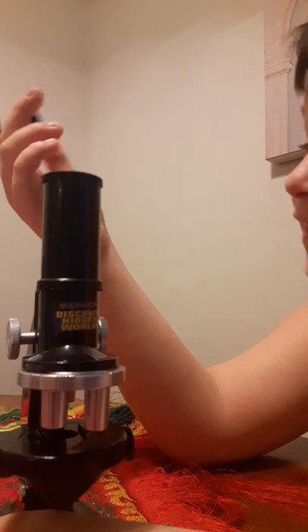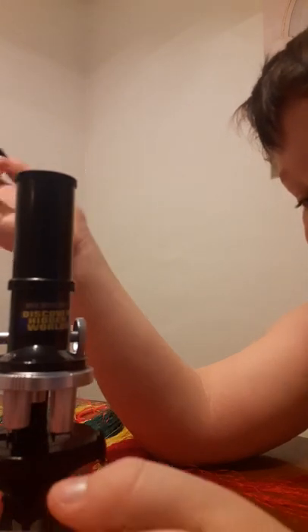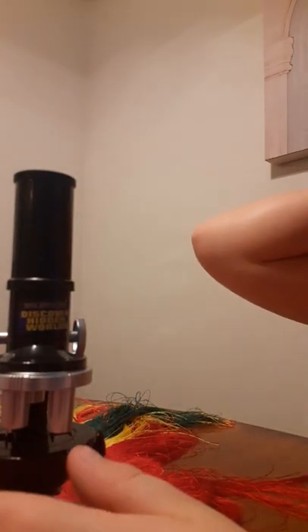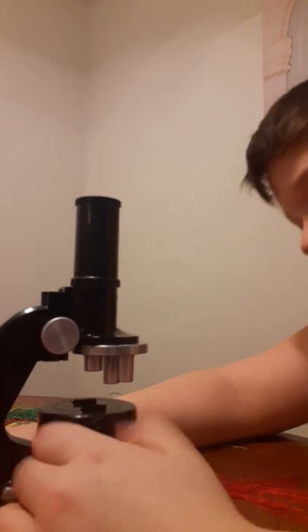As you can see, the microscope has an adjustable lens. When I came in here, this thing had a cap and I didn't know until I took it off. I'm like, it's a cap. And then we have a functioning light switch at the bottom, the basic stuff. And then you have one that is spring-loaded, and one you can pull to set up your rhythm of what type you need.